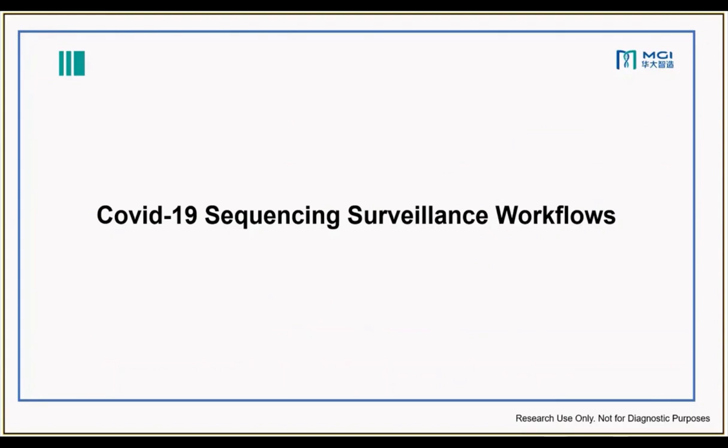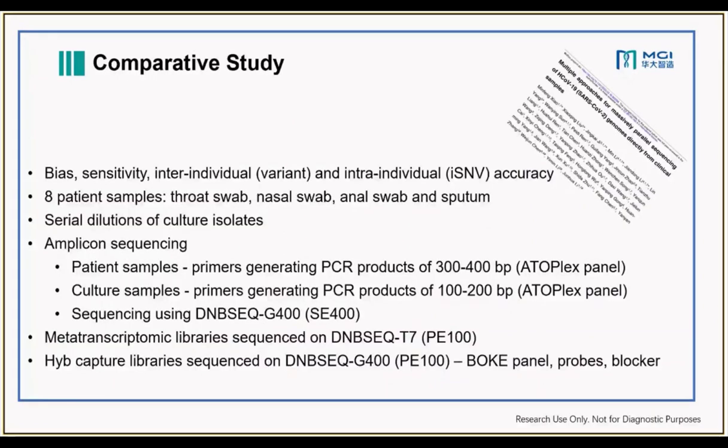Now going forward, there are different sequencing surveillance workflows that have emerged, and we wanted to compare these different approaches. Minfeng Shao at BGI led the research on this comparative study. The goal was to really validate bias, sensitivity, inter-individual variance, and intra-individual accuracy.